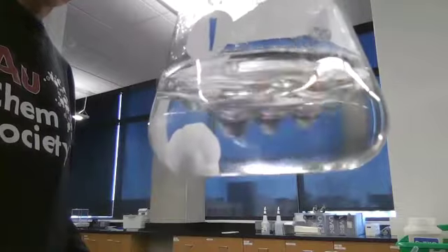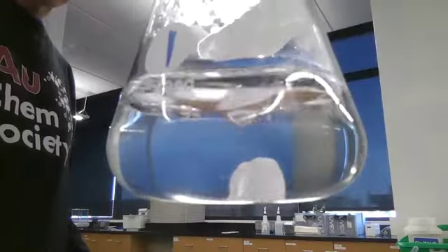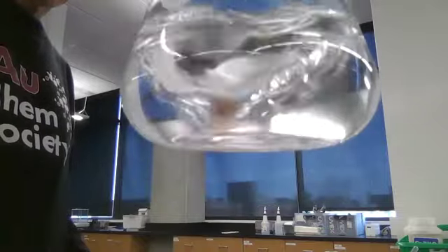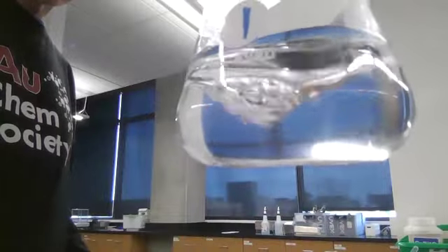So iodine is being produced, yet it's being eaten up by the thiosulfate at the moment. Once all the thiosulfate is reacted away, bada bing, the iodine will start reacting with the starch, turning it purple brown.